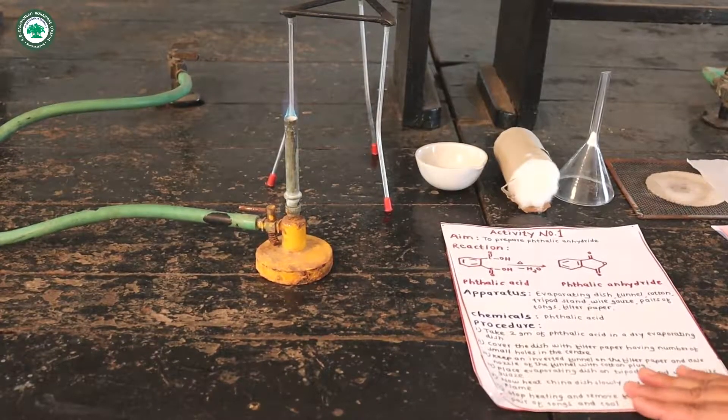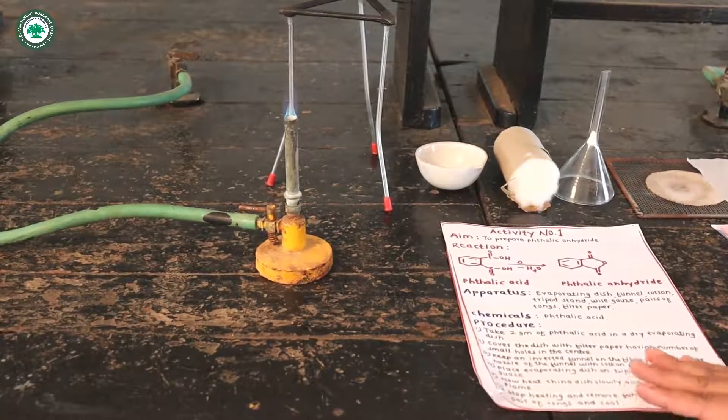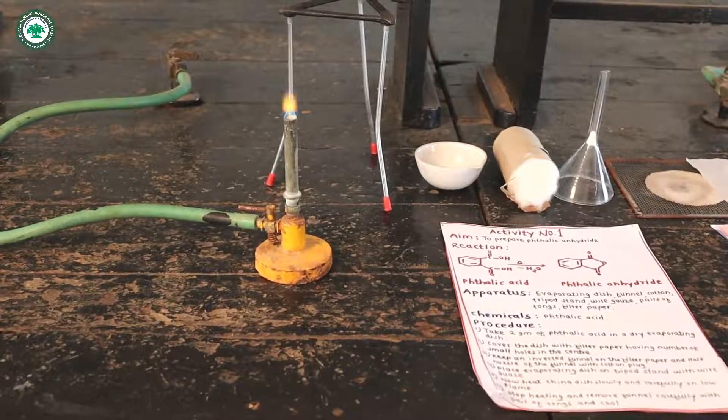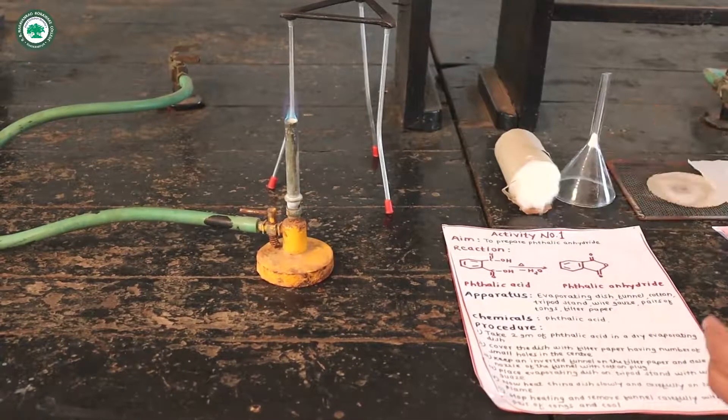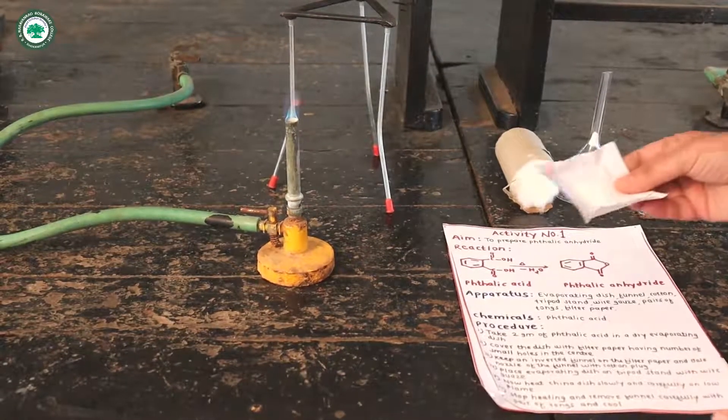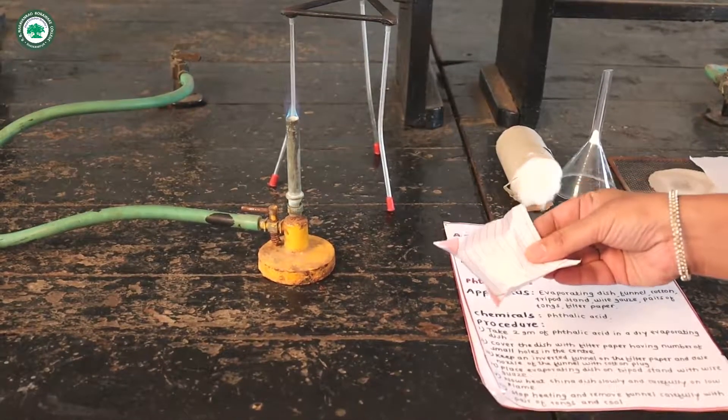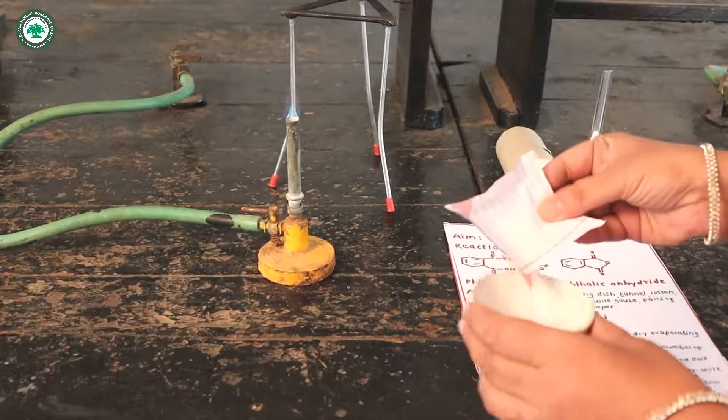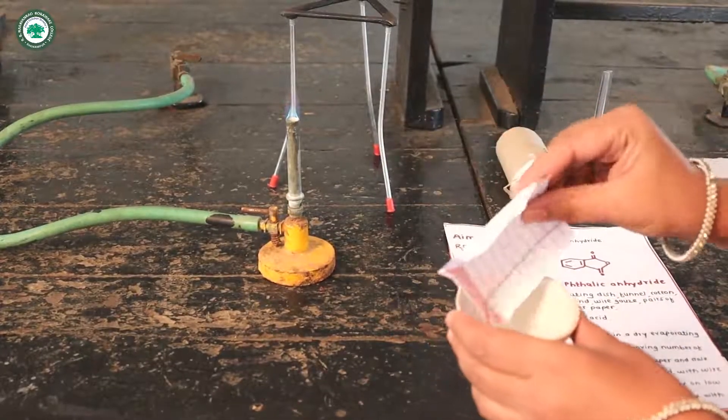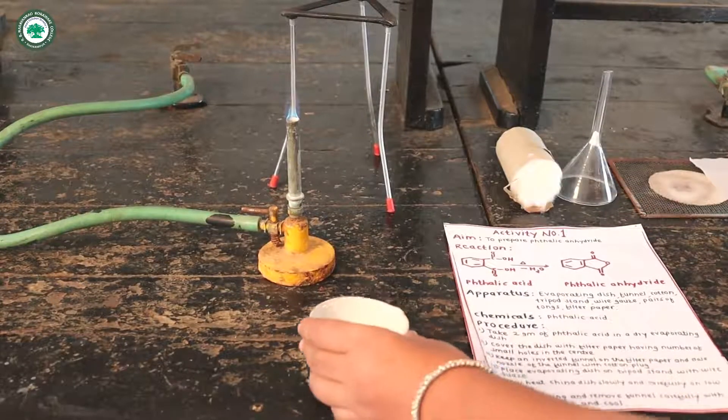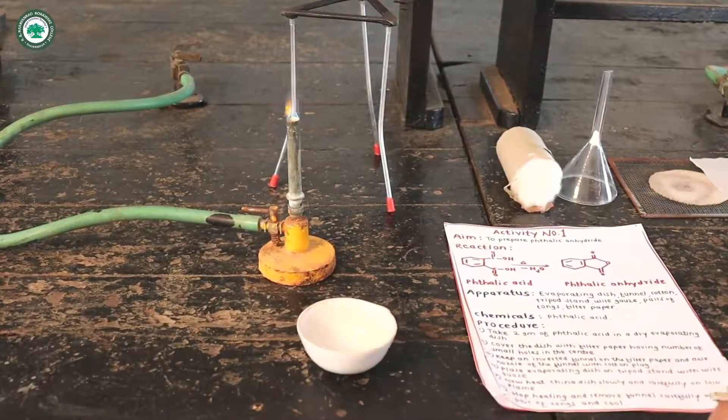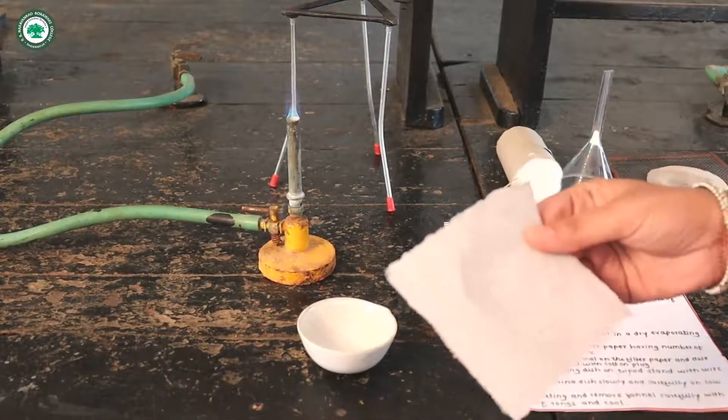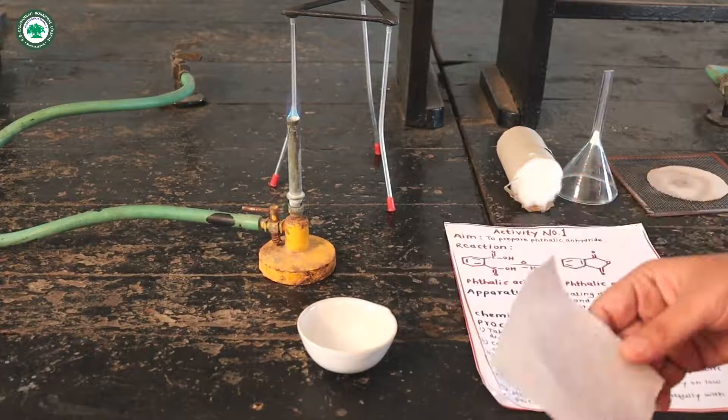Now take 2 grams of phthalic acid in a dry evaporating dish. Then cover the dish with filter paper having number of small holes at the center.